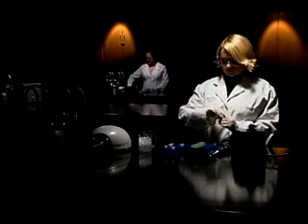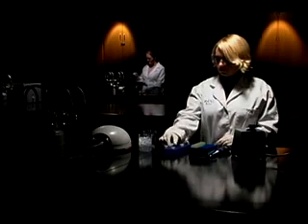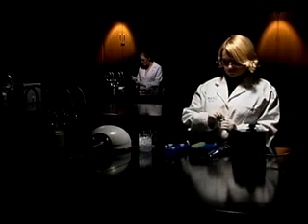This experiment will demonstrate the existence of plasmid DNA in E. coli cells. To isolate the plasmids, the other parts of the cell must first be broken down. Obtain a microcentrifuge tube of suspended E. coli cells. Pipette some cell lysis solution into the tube, cap it, and gently mix it by inverting it.